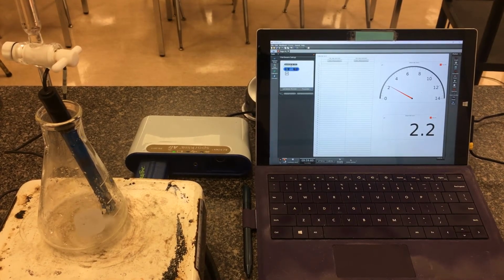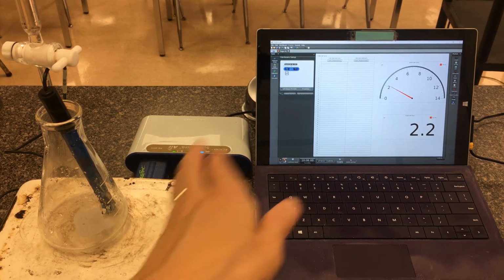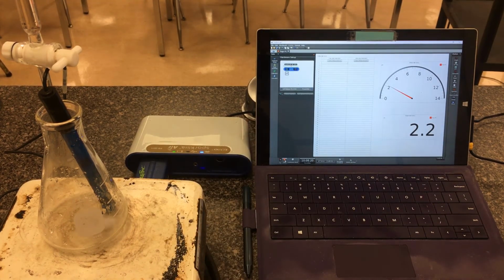Alright, so I reset the titration one more time. Again, I pipetted in 10 milliliters of unknown HCl solution here on the bottom. We have our pH probe here that's connected to our Capstone program here. What I've done this time is I've actually diluted the base by 2. So previously it was 0.1 molar. Because I doubled the volume, we're about 0.05 molar right now. This will hopefully give you a little bit more detail when we actually get around to doing our titration curve.